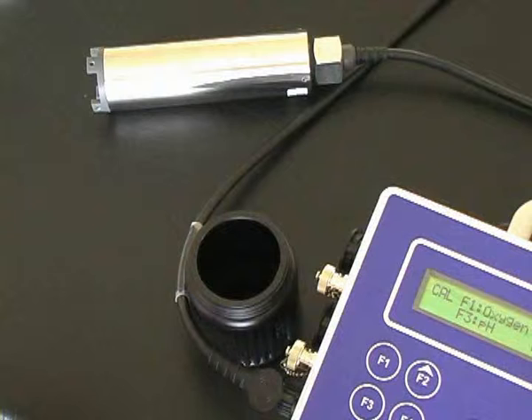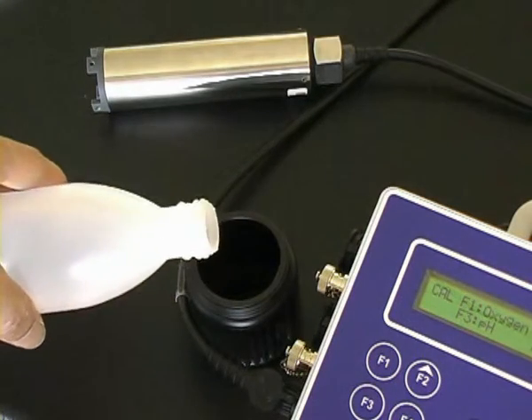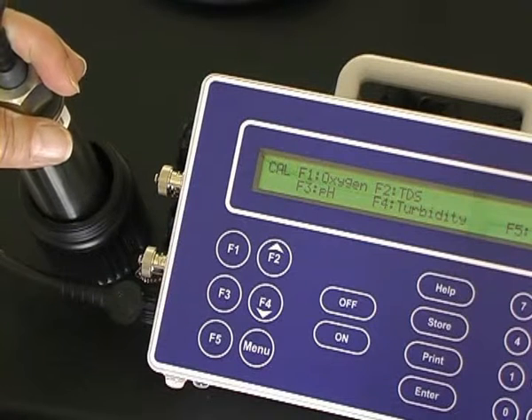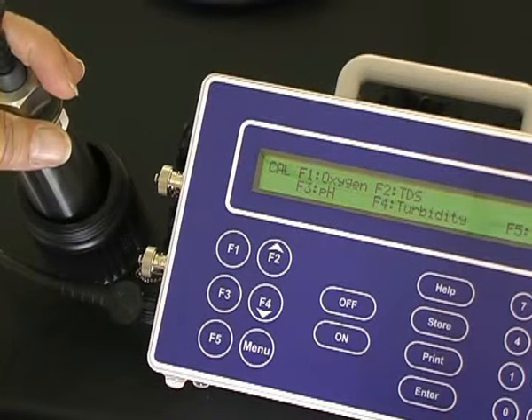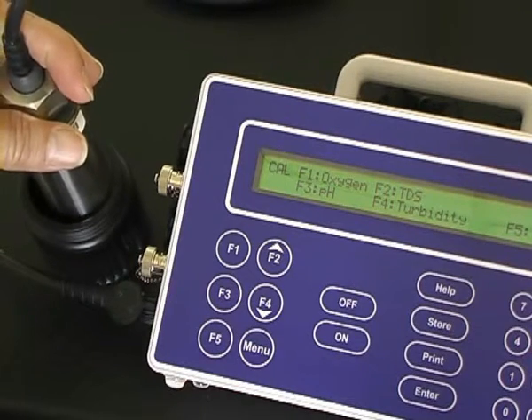The first point calibration of the turbidity sensor is in deionized water in a black jar. Pour the deionized water into the jar. Place the turbidity sensor in the jar, but do not allow it to touch the bottom. It should have at least 30mm underneath and around its sides.